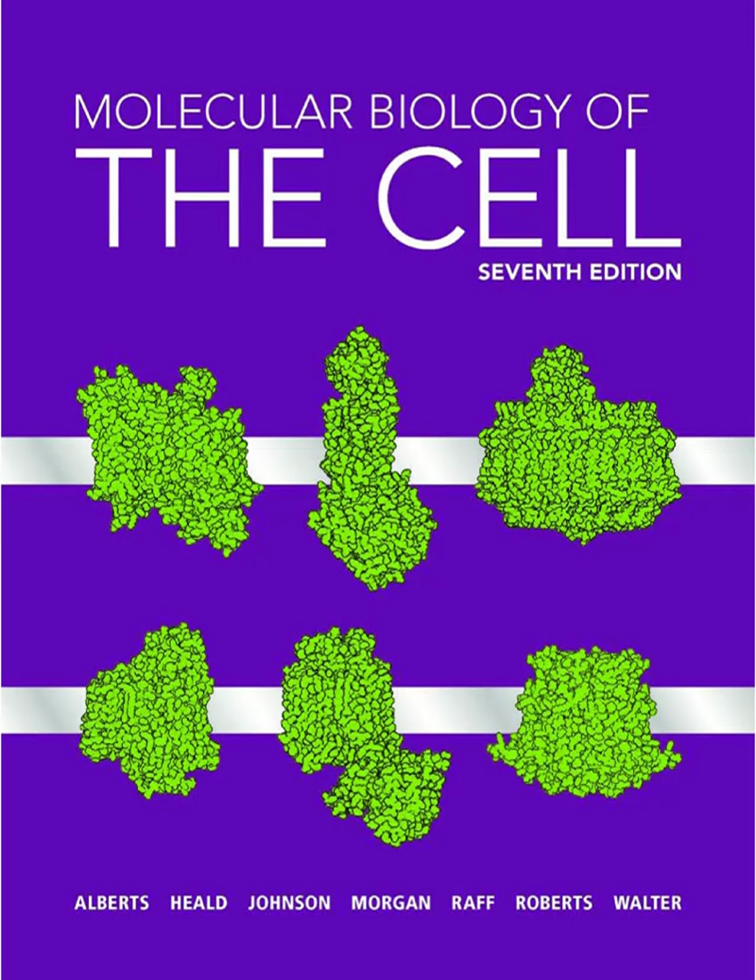Nope. And the real revolution came when scientists realized they could take the gene for GFP, clone it, and put it into other organisms. So the cells make their own fluorescent tag. Precisely. You can engineer cells or whole organisms to produce GFP, lighting them up from within.